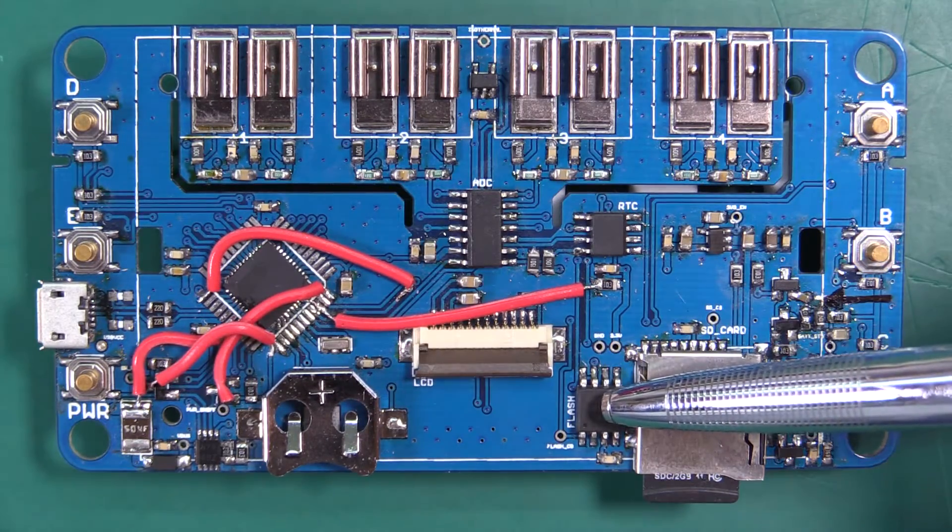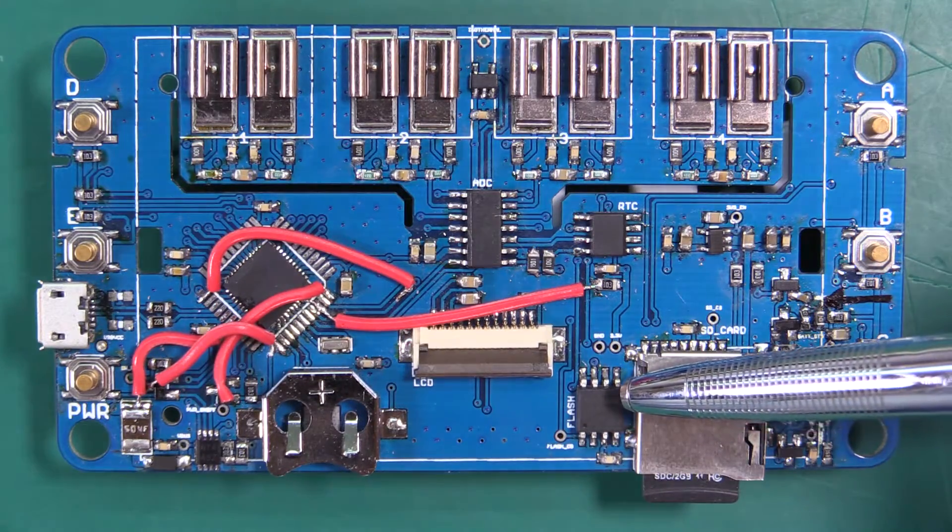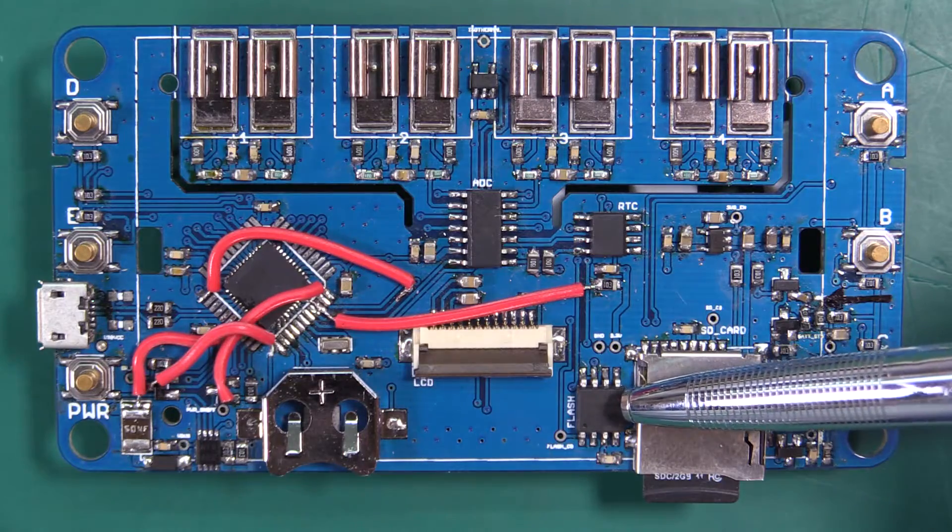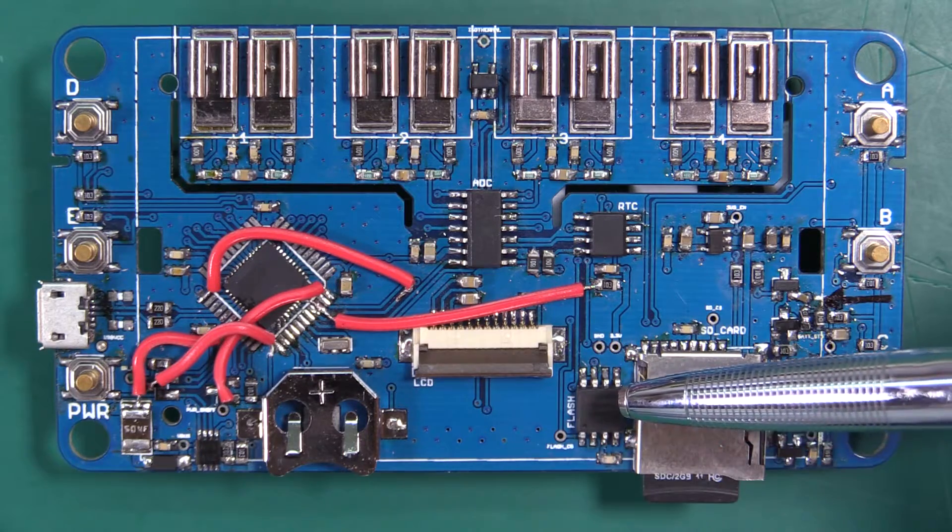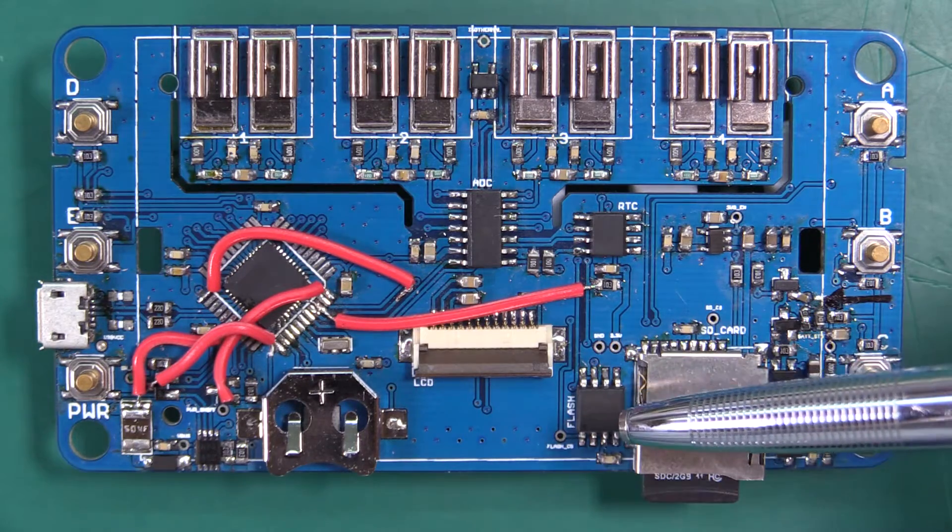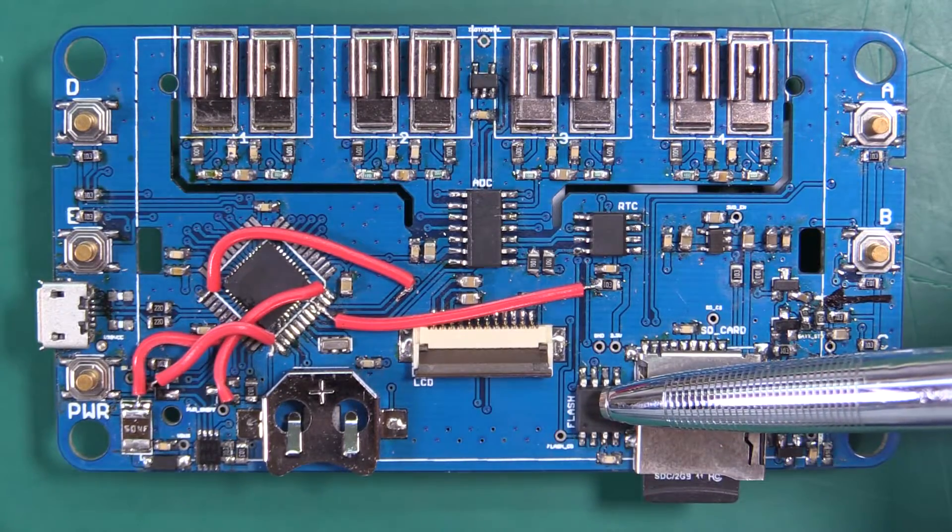This is a one megabyte flash chip. We're not currently using this in the firmware but we are going to be populating this in production.